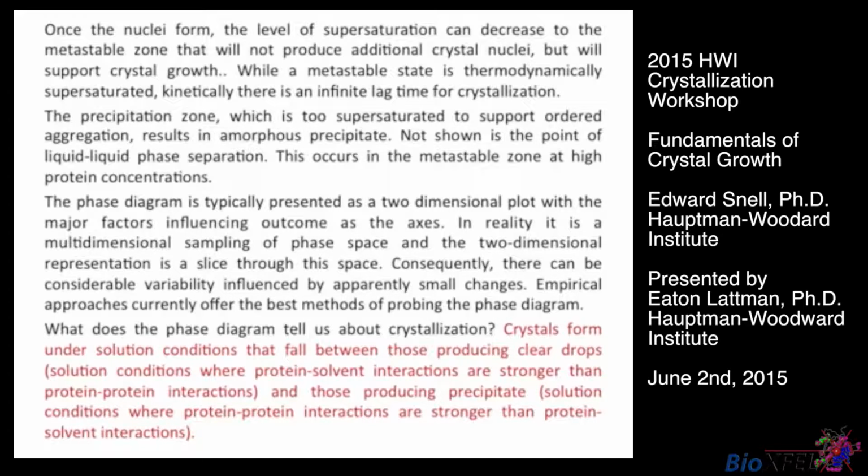It's a function of temperature. It's a function of additives of various kinds in addition to primary precipitating agents. Key message: crystals form under solution conditions that fall between those producing clear drops and those producing precipitate.